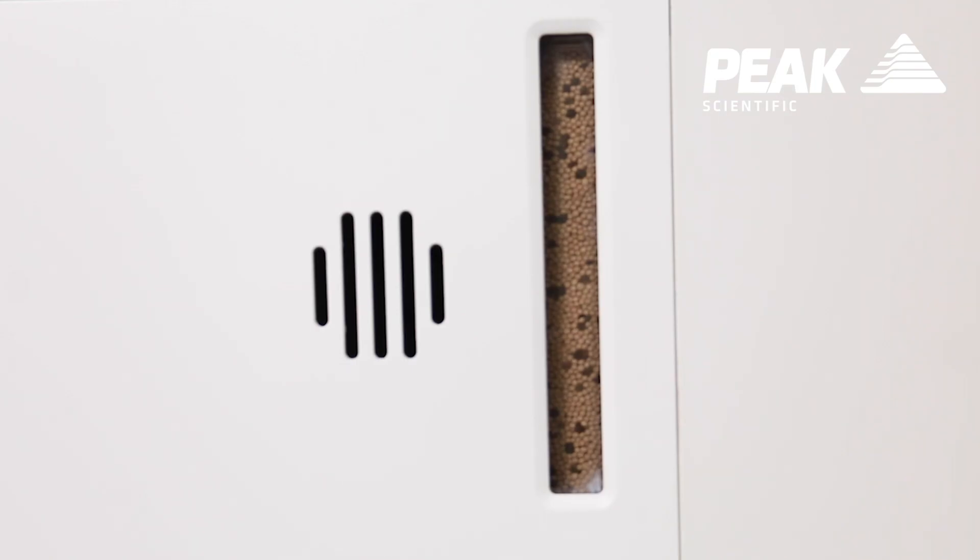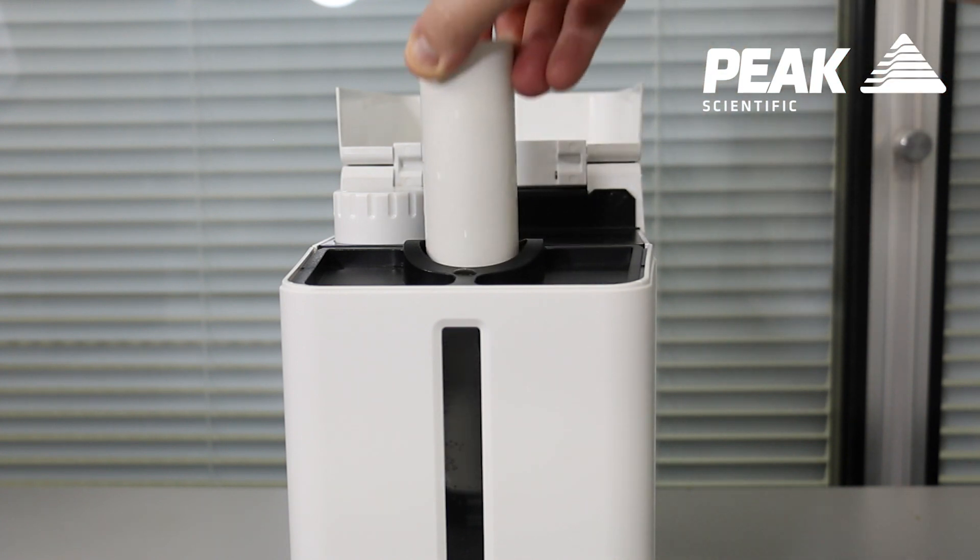The consumables for the unit are a desiccant cartridge and a deionizer cartridge. In terms of delivering deionized water, we realize that different labs have different setups, so we're actually offering three different modes of water delivery to the system.